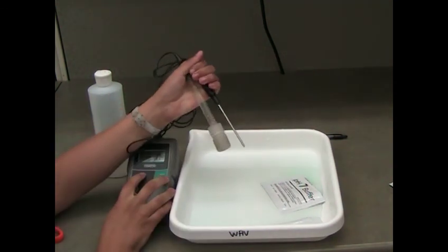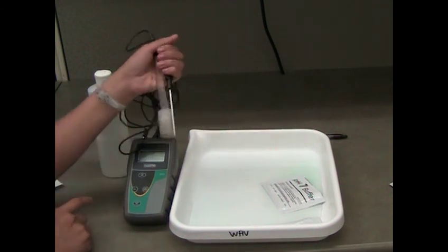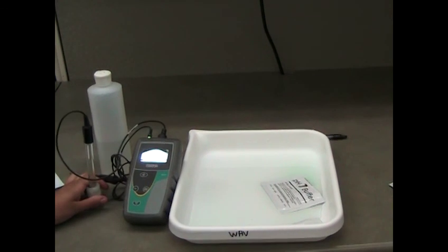If your pH meter is not calibrating properly, try cleaning the probe using the instructions provided in the instrument user manual or contact your local WAVE coordinator for help.